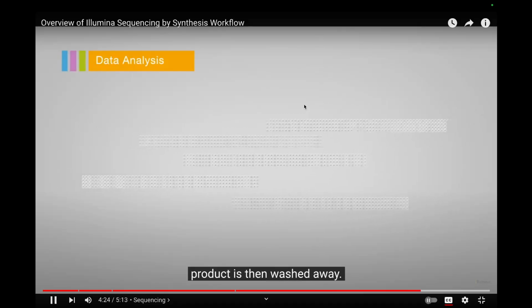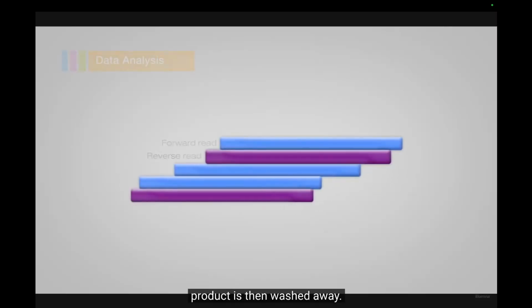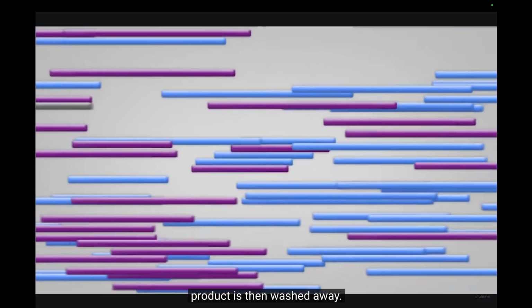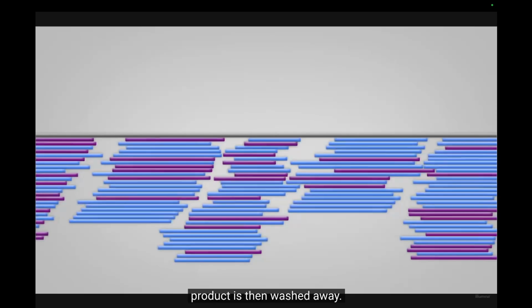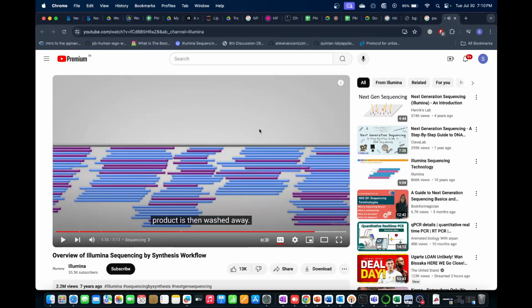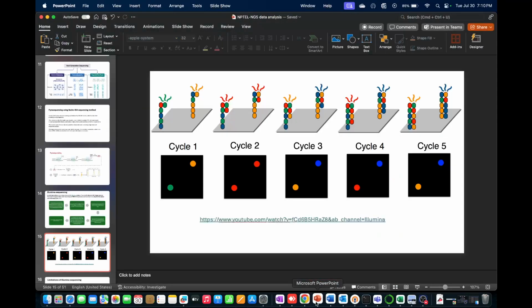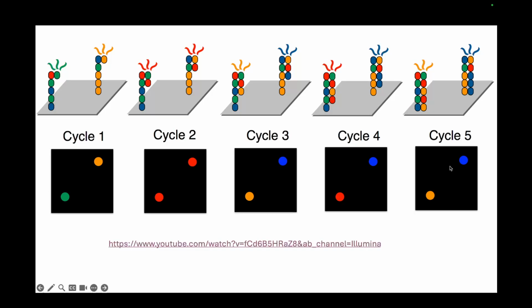For each sample, reads with similar stretches of base calls are locally clustered. Forward and reverse reads are paired, creating contiguous sequences. These contiguous sequences are aligned back to the reference genome for variant identification. Okay, I think that is all. The variant identification and the alignment and everything will come to that in later classes. Just wanted to give you an idea about how Illumina sequencing works.